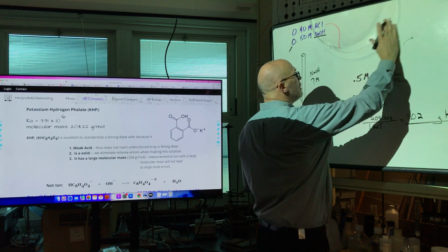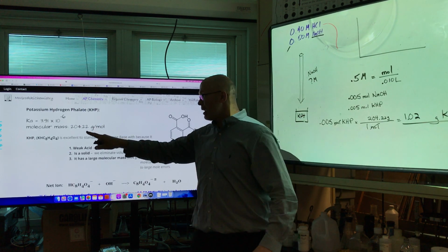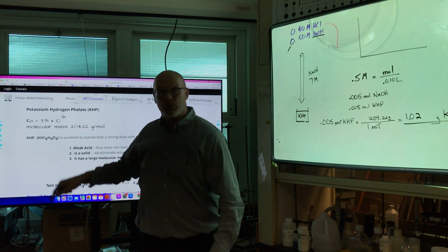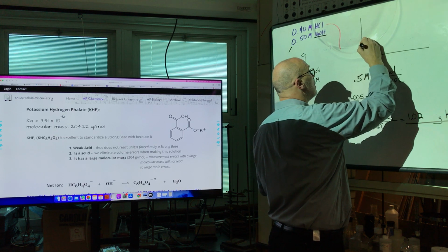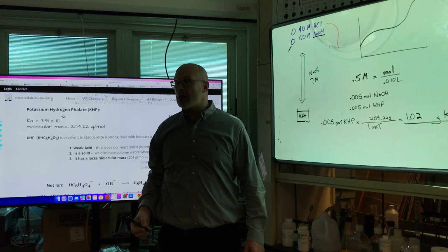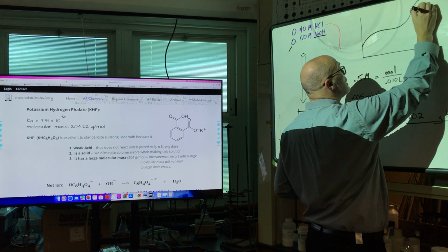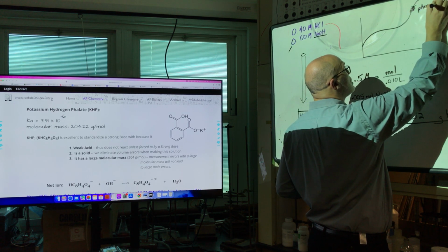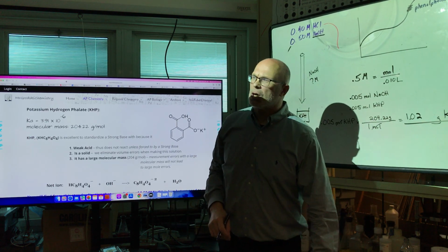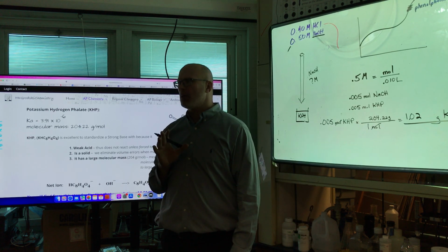Here's the reasoning. What kind of titration is this? This is a strong base, weak acid titration. What's the curve look like? This asymptote is above what? 7, below 7, on 7? Right, so phenolphthalein will be a great indicator to use. Phenolphthalein, P-H-T-H-A-L-E-I-N. And it goes from what? It's going to go from colorless in acidic solution to pink when it's basic.